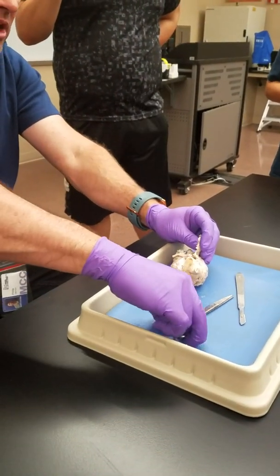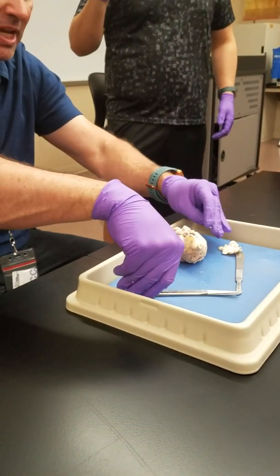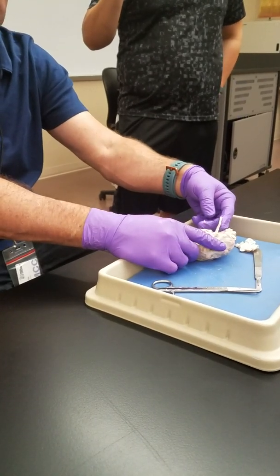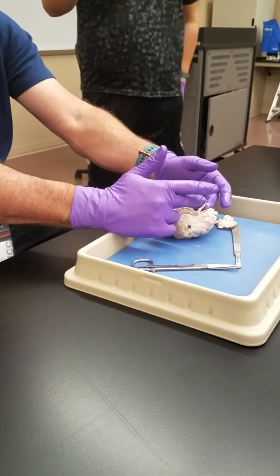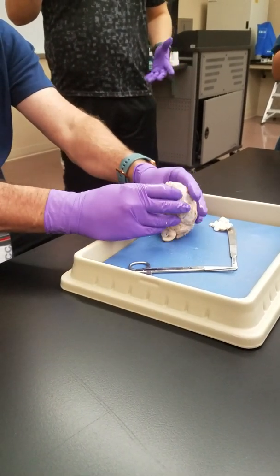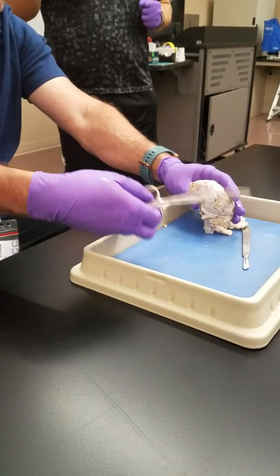So we're going to cut away this meninges. The outermost one is called the dura mater. Here you can still see remnants of the optic nerve. So this is the optic nerve right here. Right here would have been the eyeballs, and then the nerve that goes from the eye to the brain, it's right here, it's called the optic nerve. We're going to learn more about those nerves here on Tuesday.